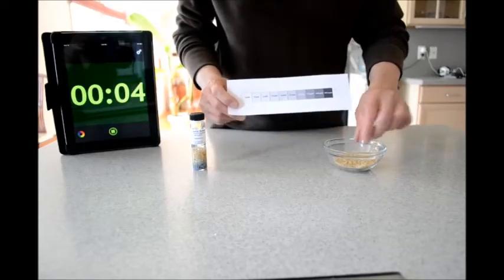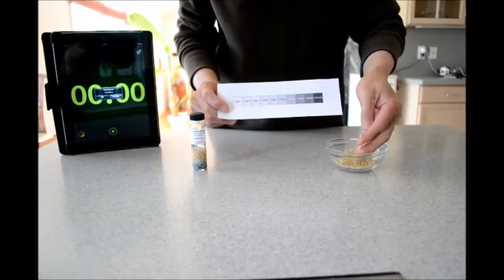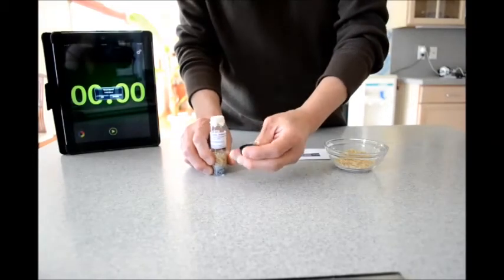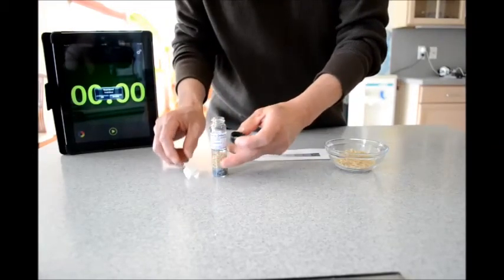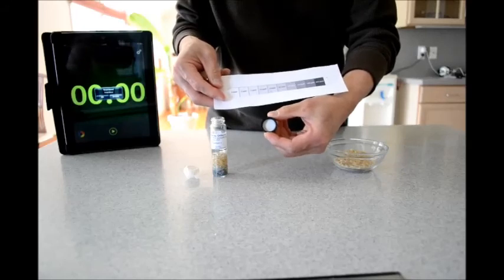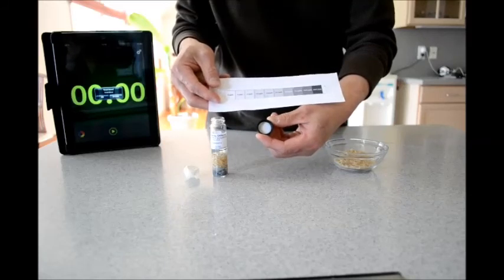Now let's see if this brown rice contains any arsenic or has more arsenic than white rice. Screw off the cap — the filter paper is still there. As you can see, there's hardly any arsenic for this brand of rice. So this brown rice is pretty safe, compared also to the white rice we tested before.